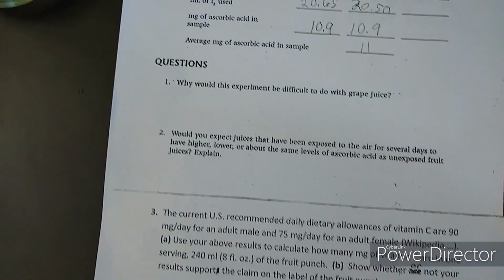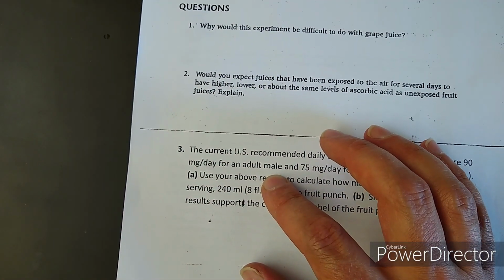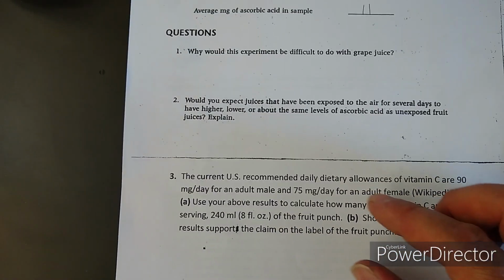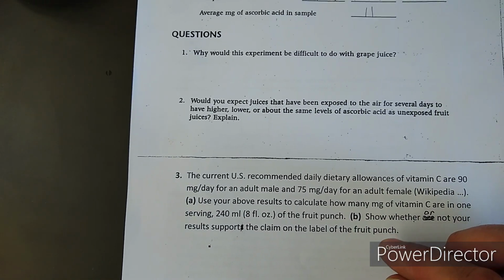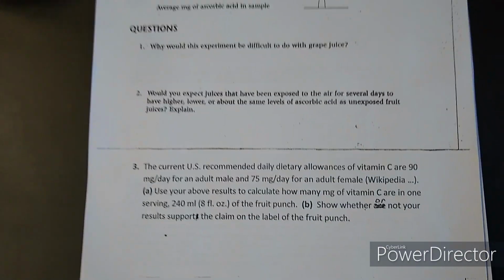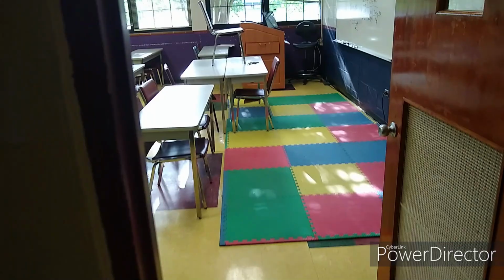Okay, so now we just need to come down here and look at this question primarily to see how our results compare to the daily recommended allowances and what the label on the bottle claims for the amount of ascorbic acid. So back into the classroom we go.